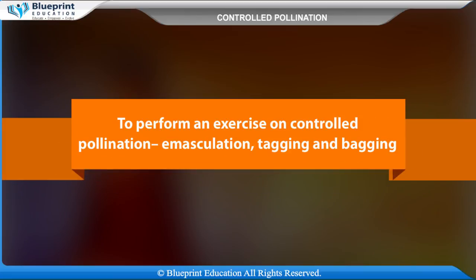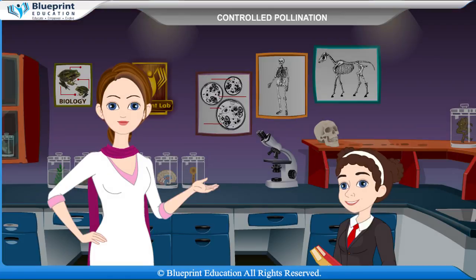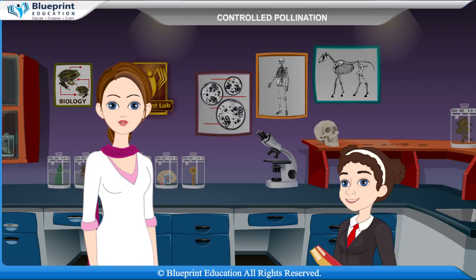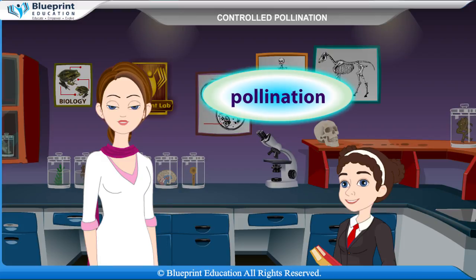To perform an exercise on controlled pollination, emasculation, tagging and bagging. The transfer of pollen from anther to the stigma of a flower of the same species is called pollination.